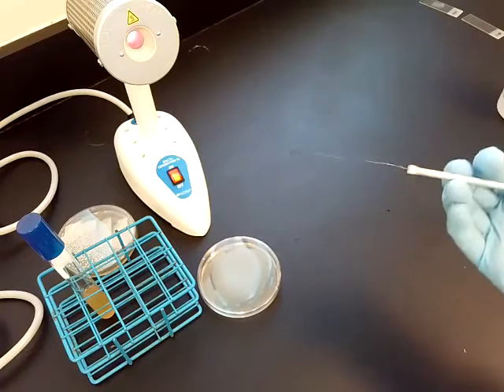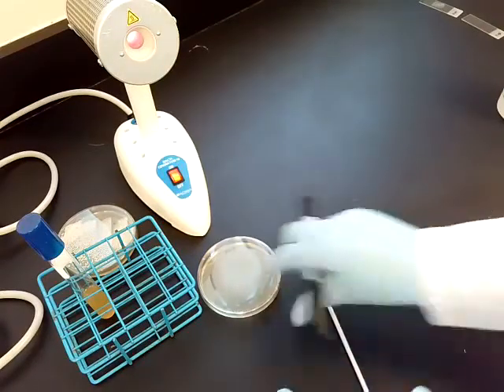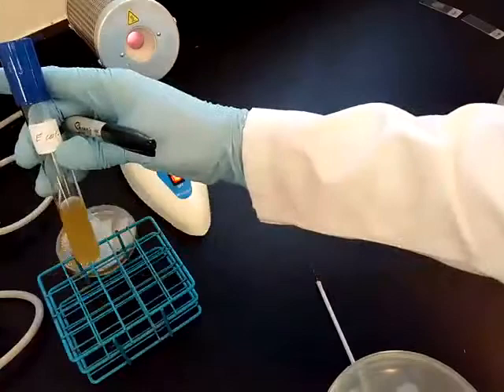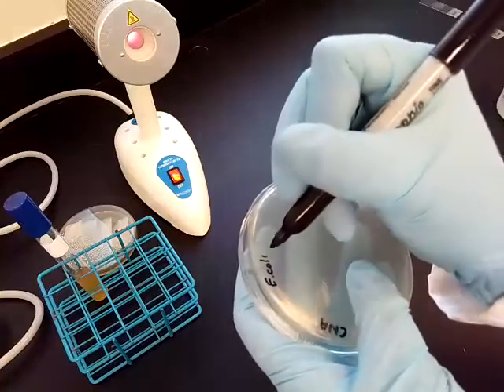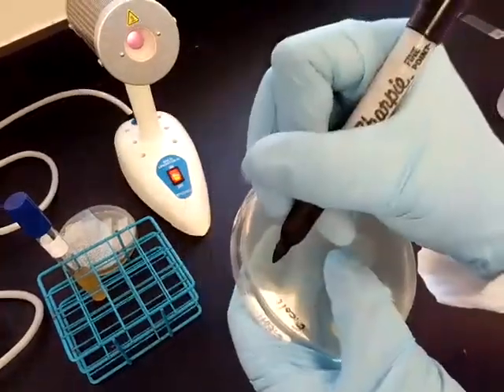So to do our streak plate method, we want to start by labeling our plate. And we're going to label it with the information that we have. So I happen to be culturing from an E. coli culture tube, so I'm just going to write E. coli. But if this were a patient sample, it would be labeled with that patient information. And then I'm also going to put today's date.